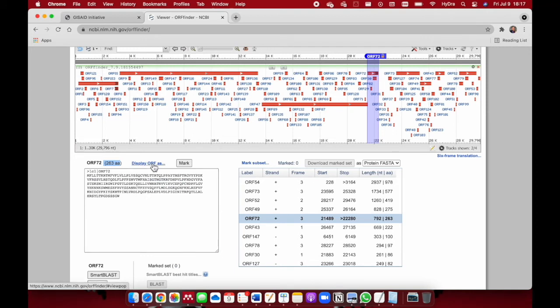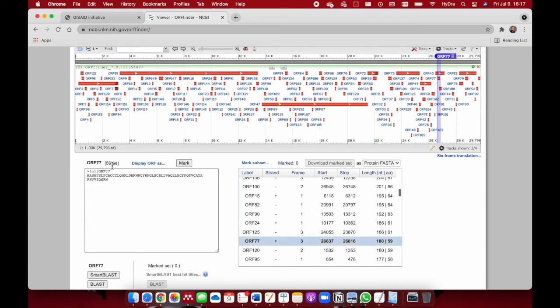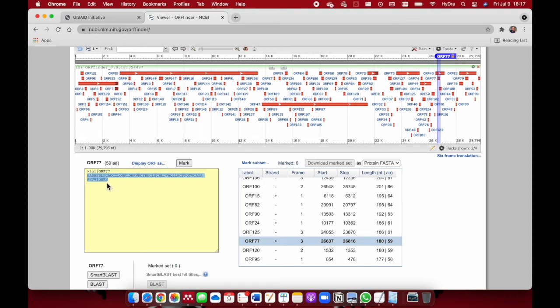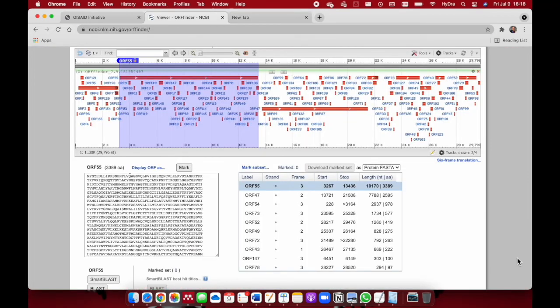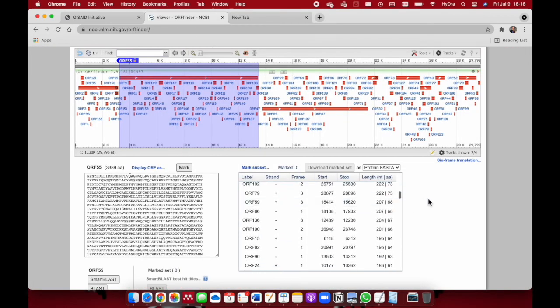You can display the open reading frame in different forms as well. Let's see this open reading frame here. It has 59 amino acids available right here. You can take it and do other searches if you want. The open reading frame is displaying as a protein sequence, not as a nucleotide sequence. If you want to search this open reading frame, you can go and do it at NCBI BLAST. This is how you find open reading frames.